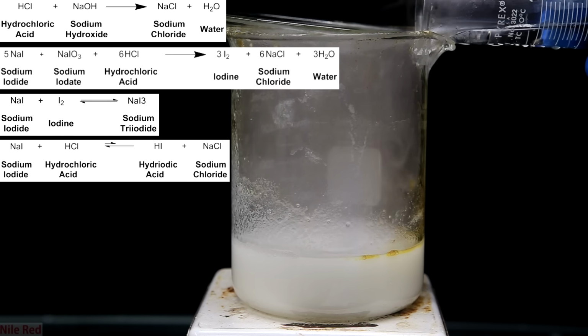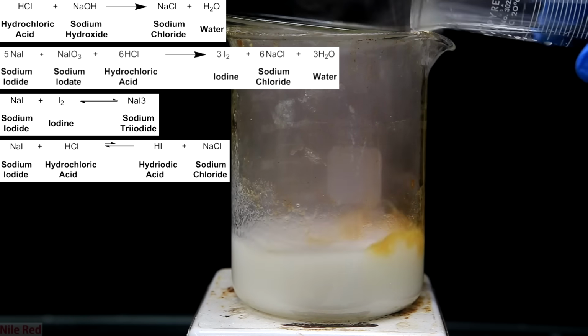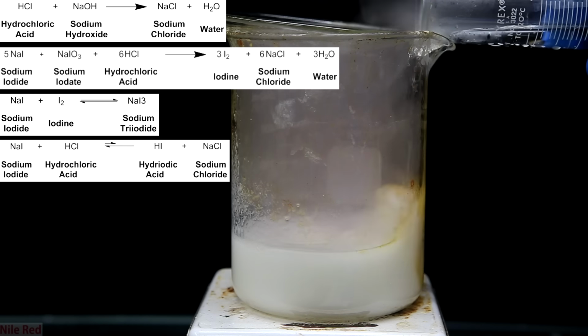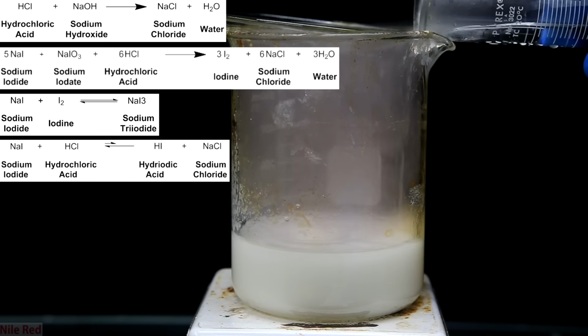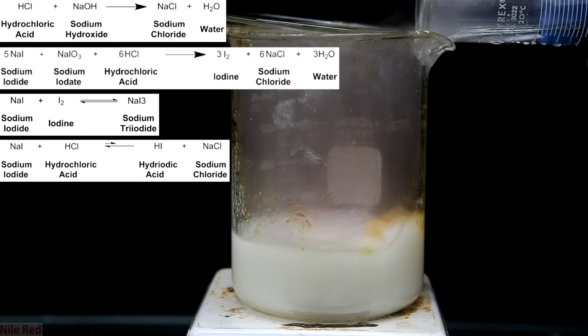When we combine all these reactions together, we're left with mostly a solution of sodium triiodide and sodium chloride. Sodium iodide has a much higher solubility in water than sodium chloride, so it should be mostly the sodium chloride that precipitates out.